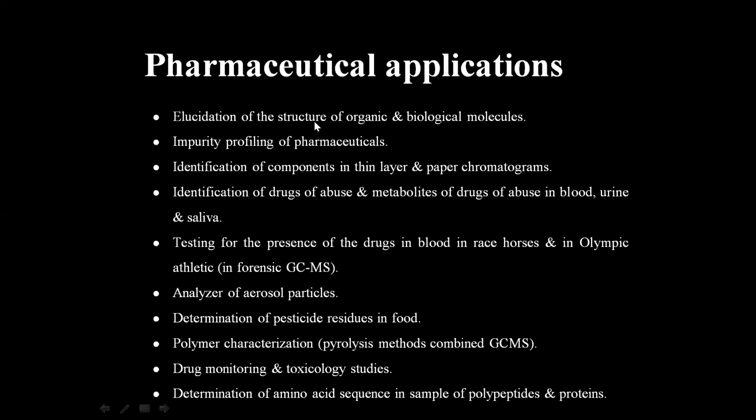Pharmaceutical applications: elucidation of the structure of organic and biological molecules, impurity profiling of pharmaceuticals, identification of compounds in thin layer and paper chromatograms, identification of drugs of abuse and metabolites of drugs of abuse in blood, urine, and saliva. Testing for the presence of drugs in blood in race horses and in Olympic athletes in forensic GCMS. Analysis of aerosol particles, determination of pesticide residues in food, polymer characterization, pyrolysis method combined with GCMS. Drug monitoring and toxicology studies, determination of amino acid sequence in samples of polypeptides and proteins.